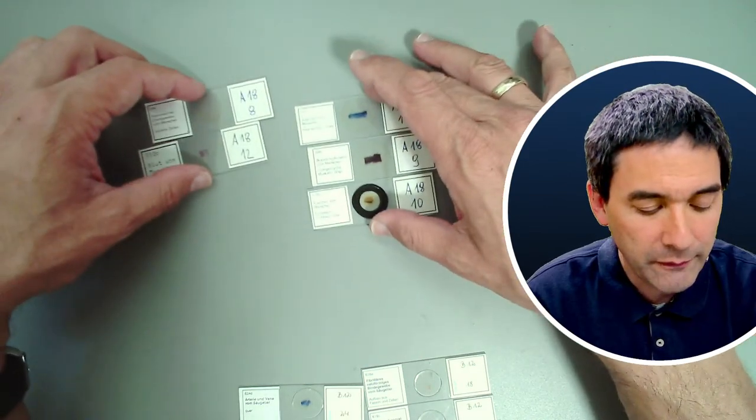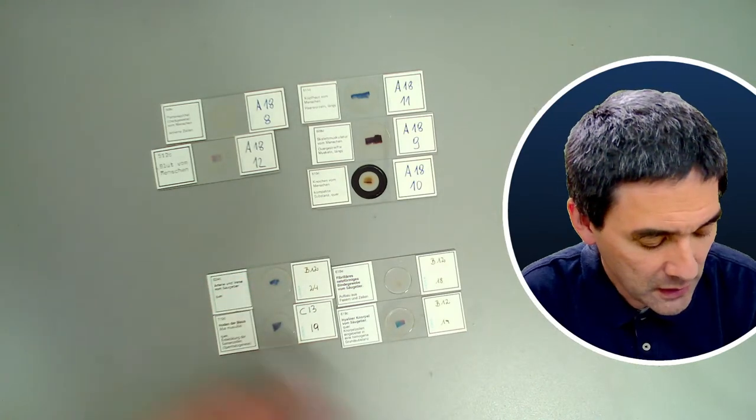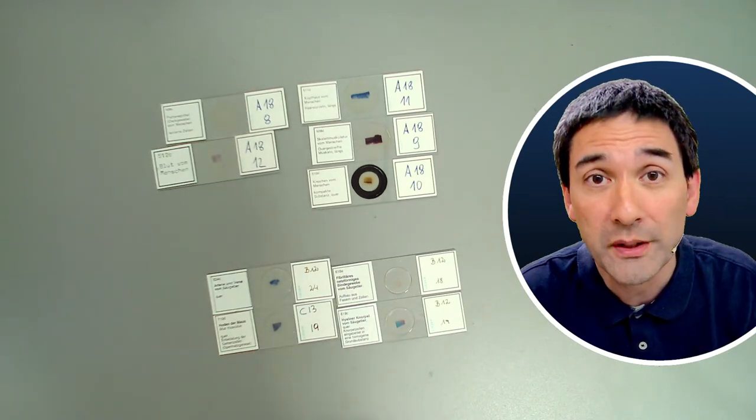Now, I do have several other slides as well that contain tissues, but sometimes these are from other mammals, and sometimes it's only labeled as being from a mammal. Those slides are labeled in German, but it says here these are all from mammals, and it's not specified which type of mammal it is. So it could be that they're also human.